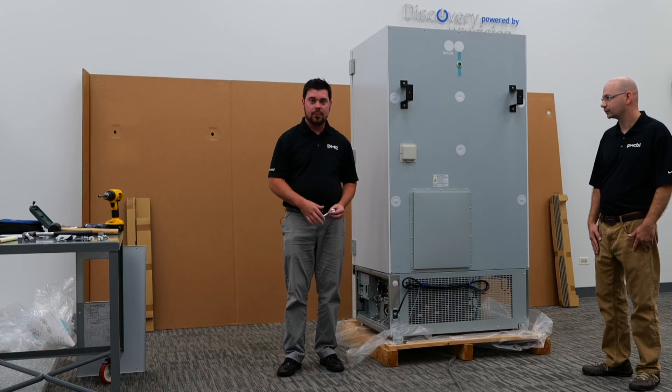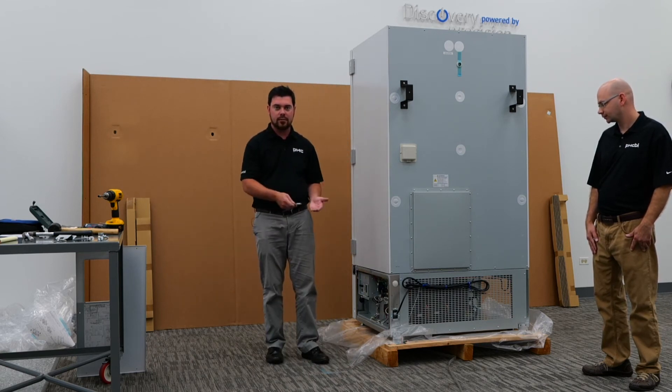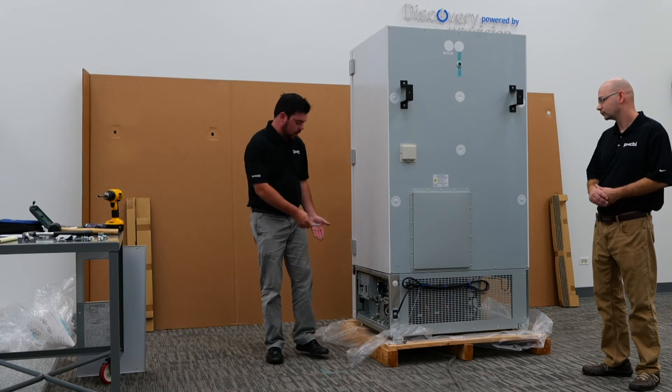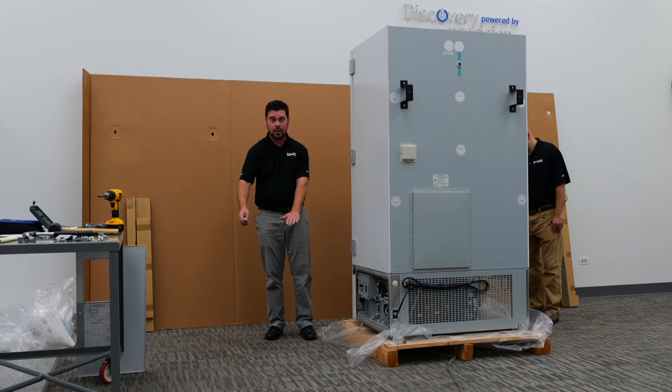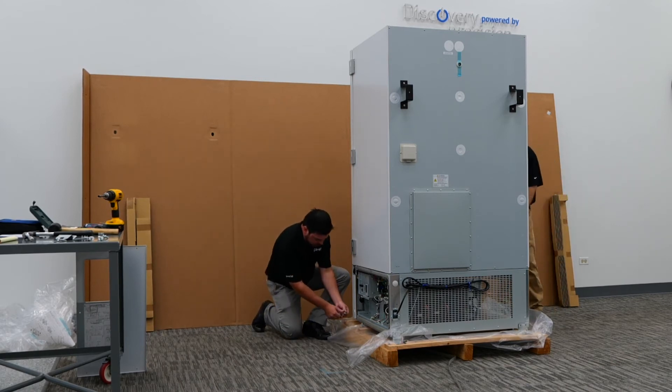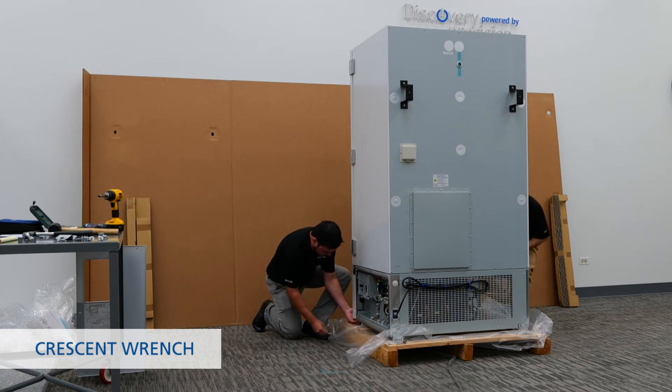Now that the front brackets have been removed fully, we want to go ahead and raise the leveling feet up on the unit. This will separate the unit from the skid fully and allow us to slide the unit down the ramp. We'll take a crescent wrench and adjust the feet.